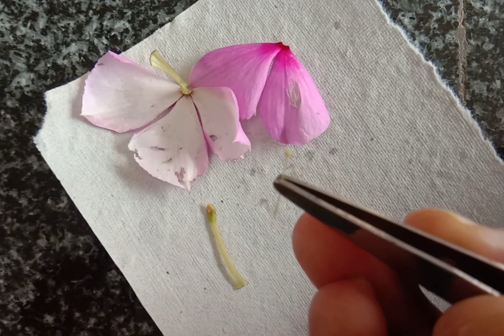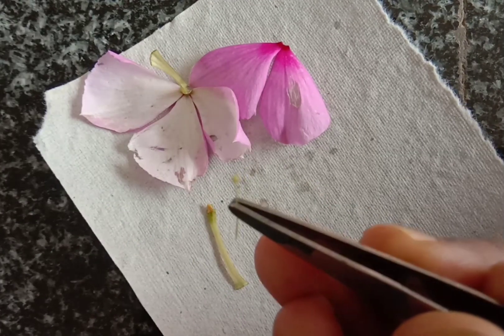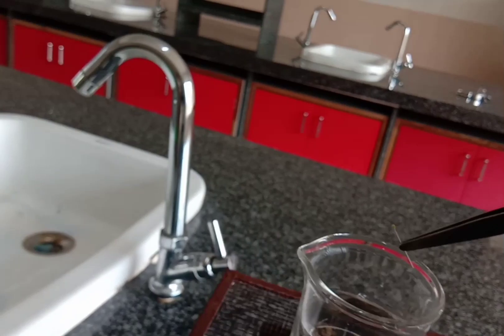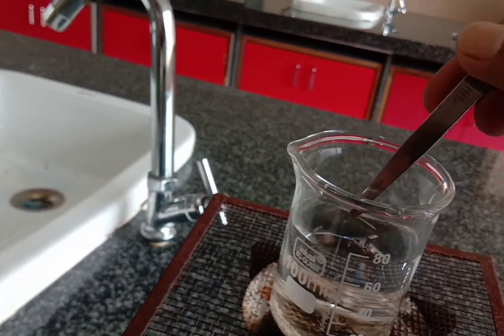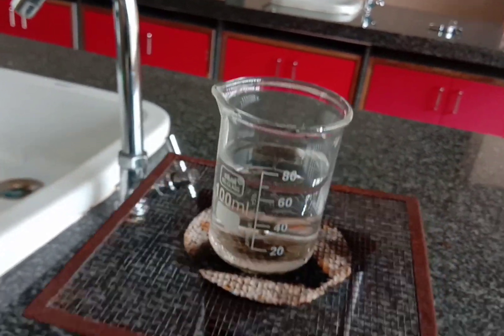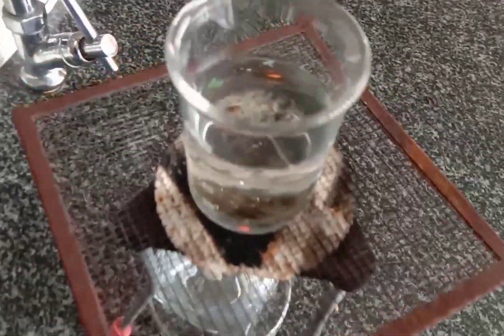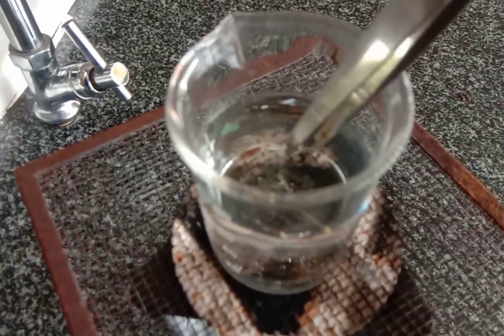Add the pistil in boiling water for a few seconds for softening of the tissues. After a few minutes, take the pistil from the boiling water and put it on a clean slide.